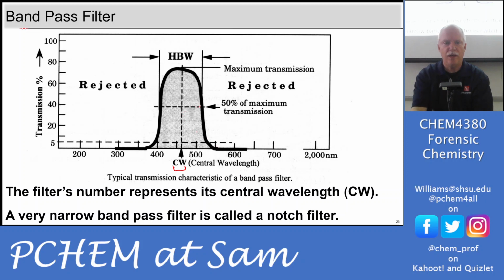So this width right here would be given as probably a delta lambda. You could use this one for illumination. I guess you could use it for observation, but it's probably just going to be an illumination filter. We're giving it a particular color to enhance contrast.